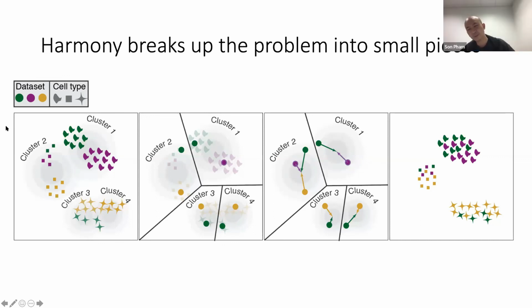So in the previous one, it actually depends on the order that you integrate? It does, yeah. That was the big result from the Scanorama paper in Nature Biotechnology a few years ago, that the order really matters. And then everyone fixed that problem, to have a better order. But you can imagine in the worst case scenario, if you try to find anchors between 1 million cells and 1 million cells, you're doing 1 million squared comparisons, right? But we never compare one cell to another cell. We only compare cells to a centroid, right? And so that's what lets us scale much more efficiently to big data sets.